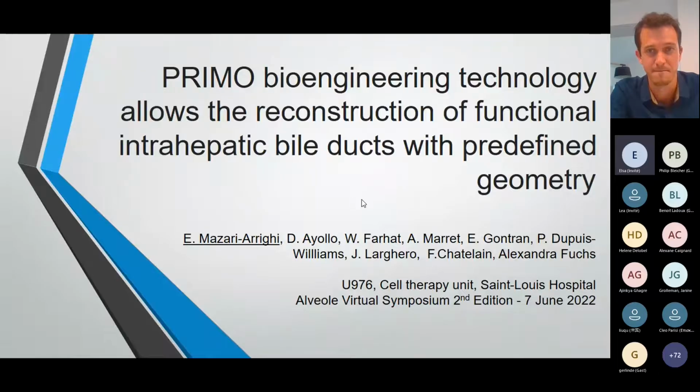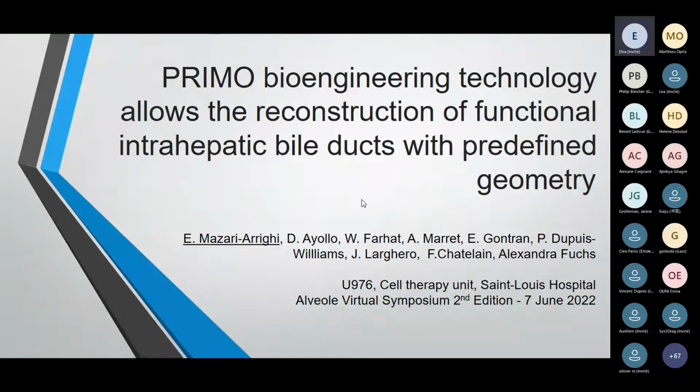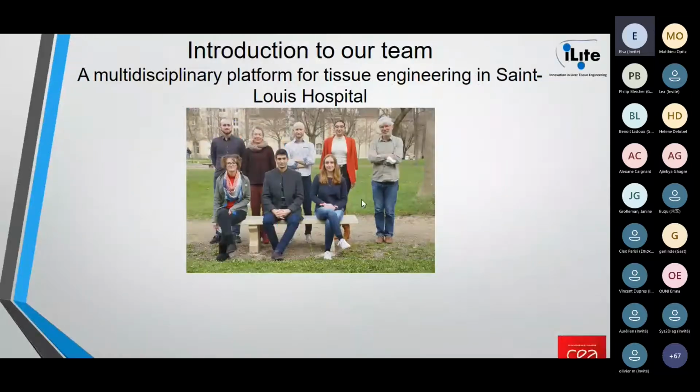First, thank you very much for the opportunity to talk about our work. Today we will show you how you can use PRIMO technology to reconstruct functional intrahepatic bile ducts with predefined geometry. But first, I would like to introduce you to our team.